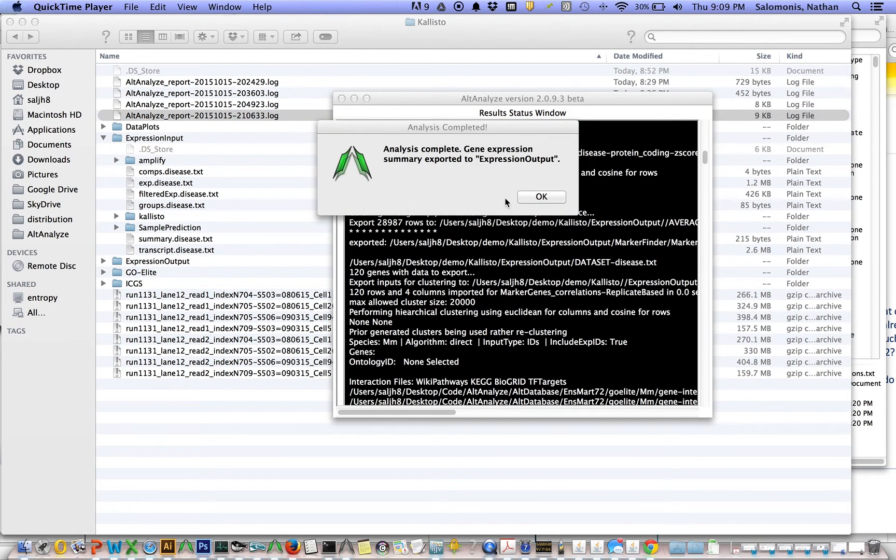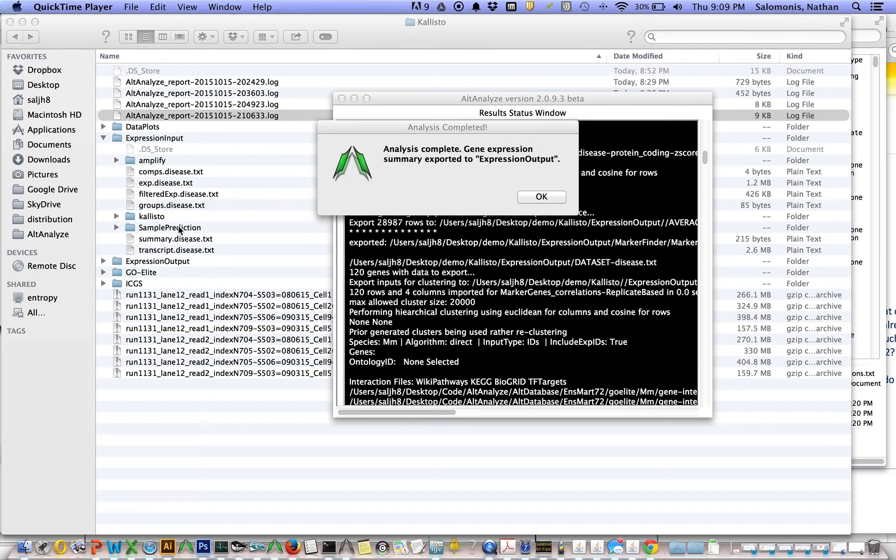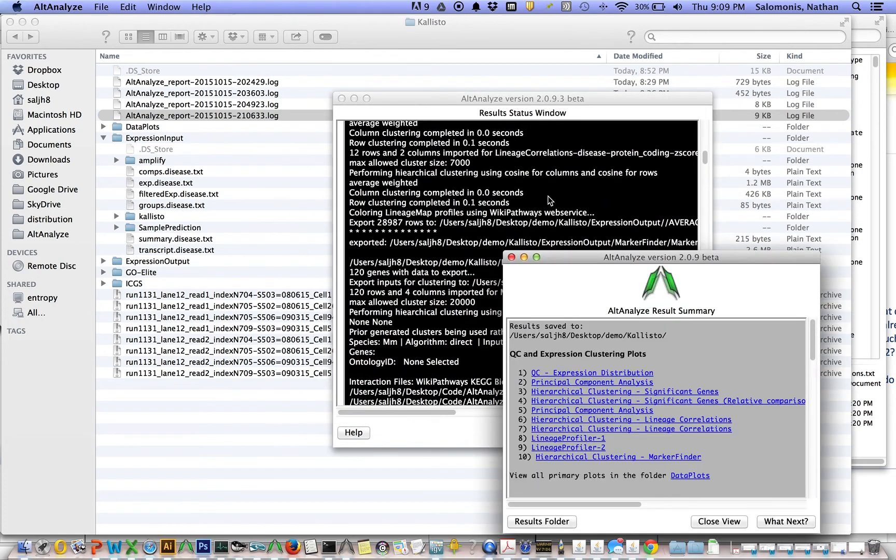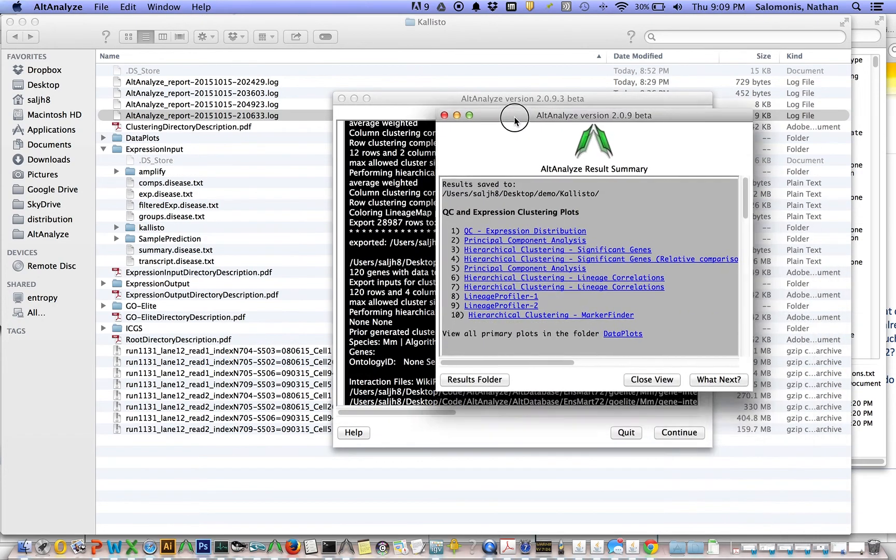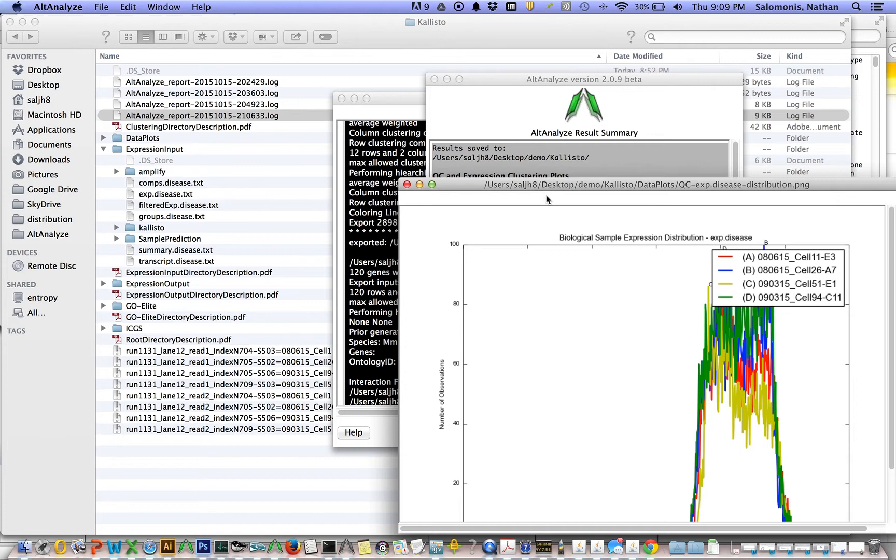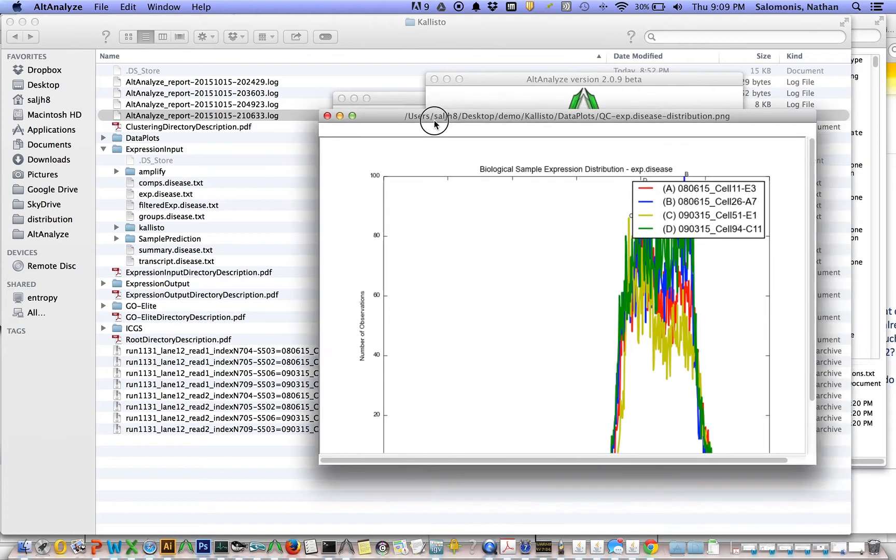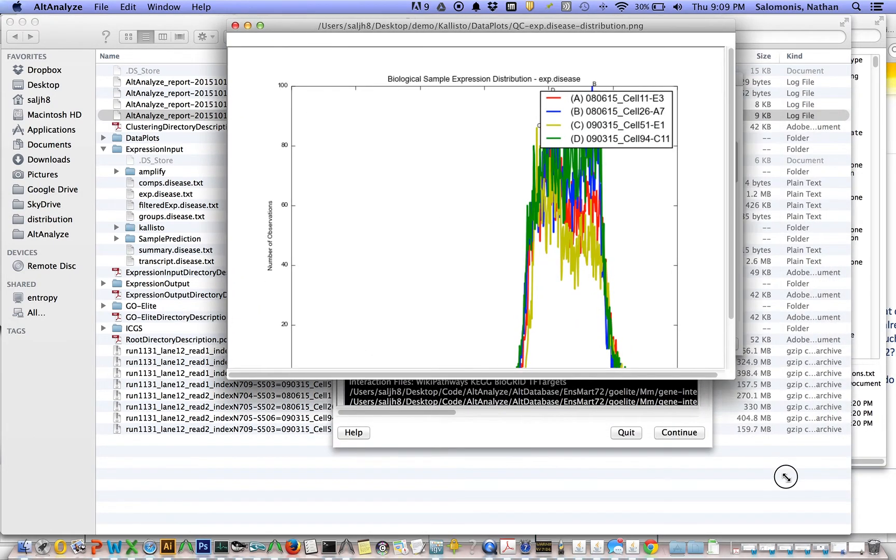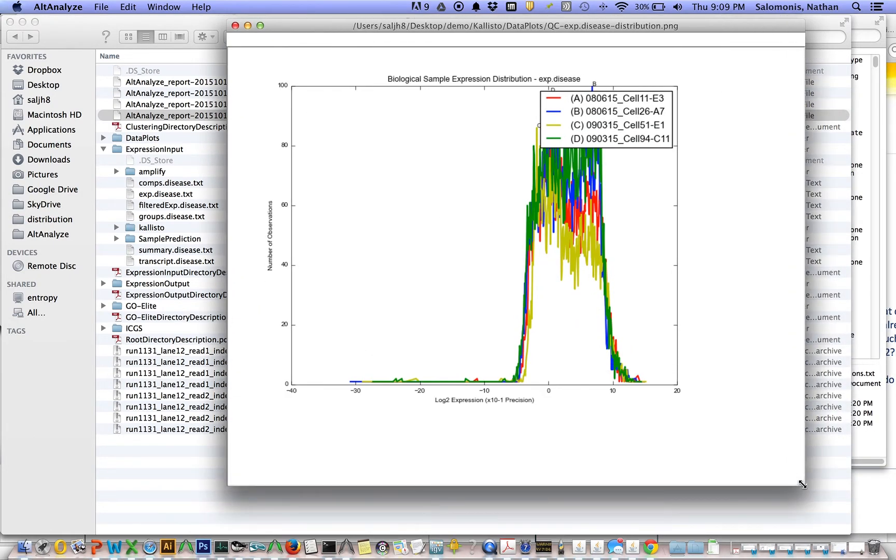At this point, the final analysis has been completed. You'll see analysis complete, gene expression summary exported to expression output. Expression output is a folder in the directory that we designated as our results folder here. If you click OK, you'll get this little summary window.